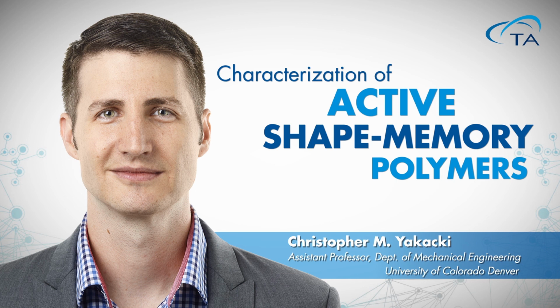I think the trick would be to get a good measurement. As long as your amplitude overall is at least about 2 microns, you'll be okay. You'll get a good measurement. So I would just make sure the gripping interface isn't causing any damage, and you're not damaging or cutting into the sample while testing. And then two, lowering your dynamic strain such that you're not causing large deformation onto that material.